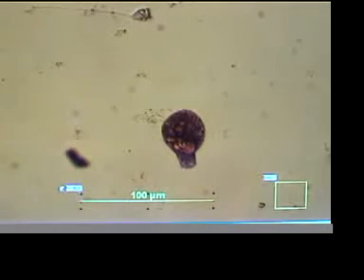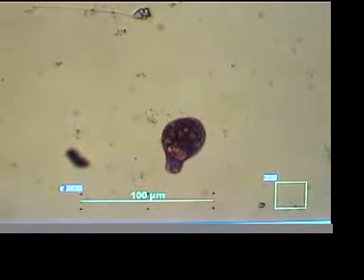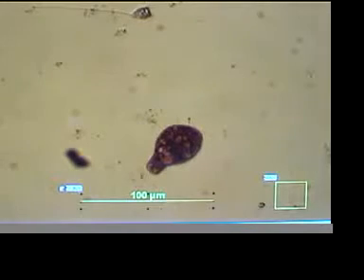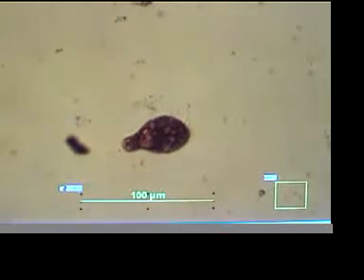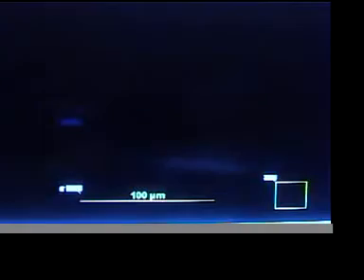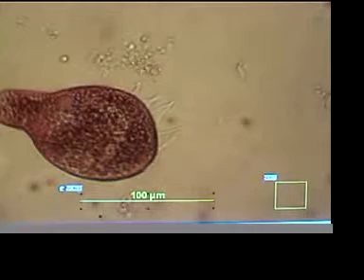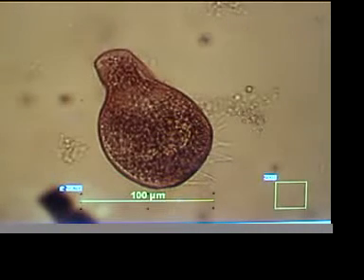Let's keep an eye on this guy. Where is he? He's on my far right of the slide. I'm zooming in on him. He's got the classic look of somebody who's going to explode. Let's take a chance — we'll go up to 10x. Try to keep him centered. The scale is not correct because I'm busy chasing him. Let's correct the scale here. There is the correct scale.